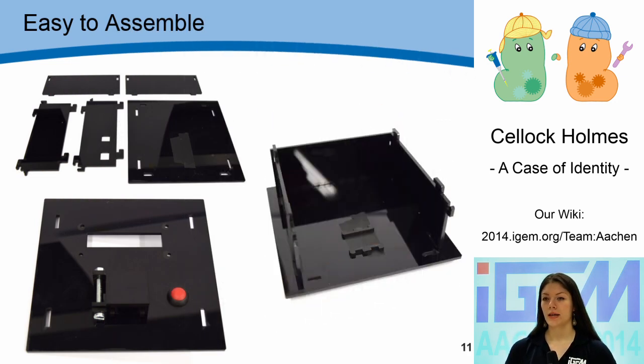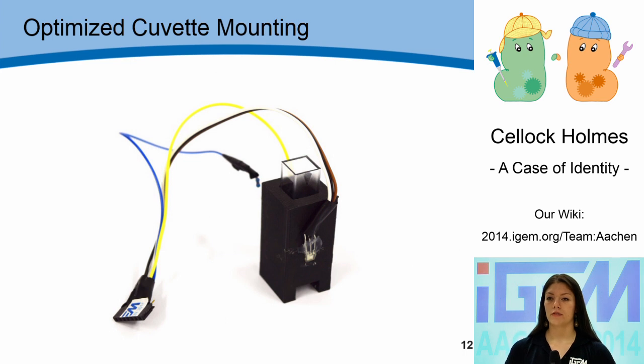Let's start with the casing – it's made from black plexiglass. We had all parts laser cut at a local fab lab, and the stencil is available for download on our wiki. The lid is also made from black plexiglass. A central element of our device is the cuvette holder, which was 3D printed and optimized to specifically fit the requirements of the device setup. At its side it has a hole for the light frequency sensor, and an orange LED is placed in a hole opposite to the sensor. Through the use of a filter, we ensure OD measurement at the usual wavelength of 600 nanometers.